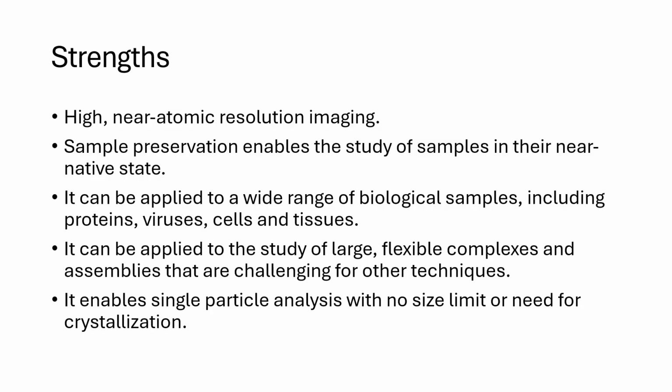Strengths: high near atomic resolution imaging. Sample preservation enables the study of samples in their near native state. It can be applied to a wide range of biological samples, including proteins, viruses, cells, and tissues. It can be applied to study large, flexible complexes and assemblies that are challenging for other techniques. It enables single particle analysis with no size limit or need for crystallization.